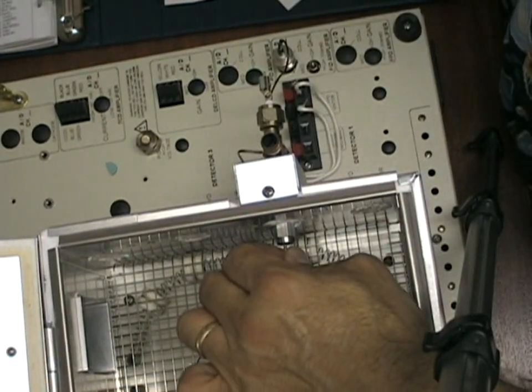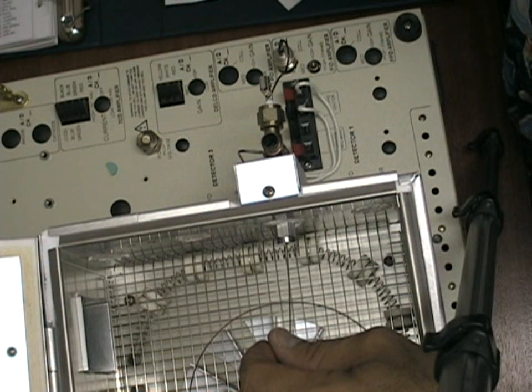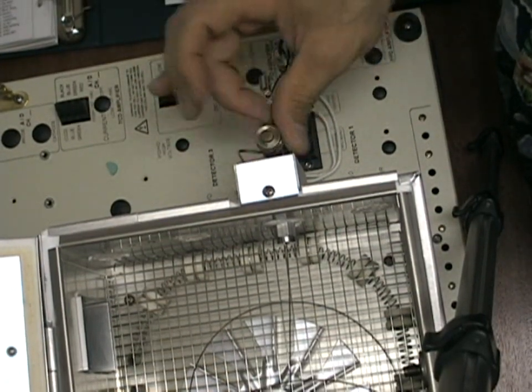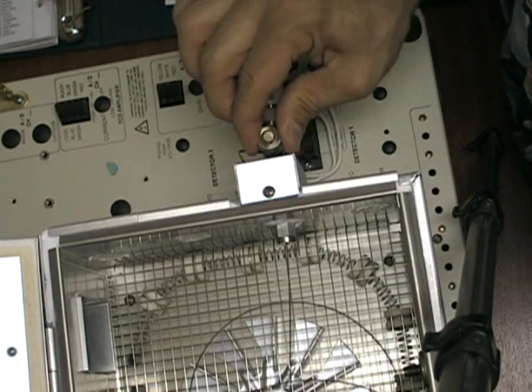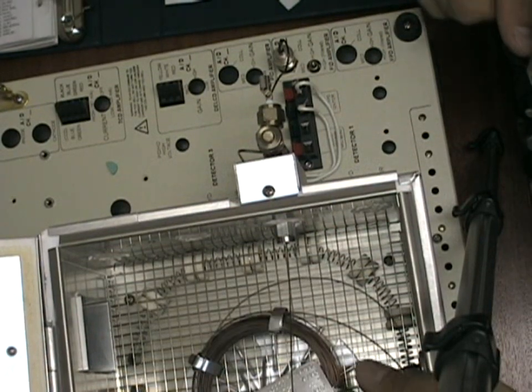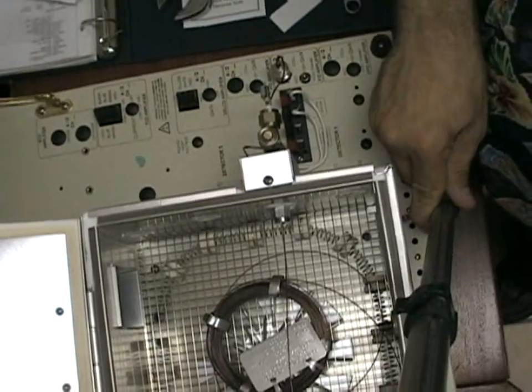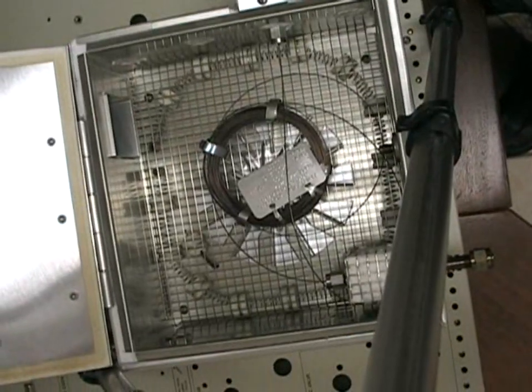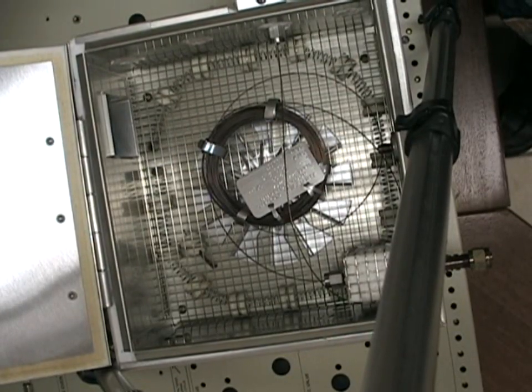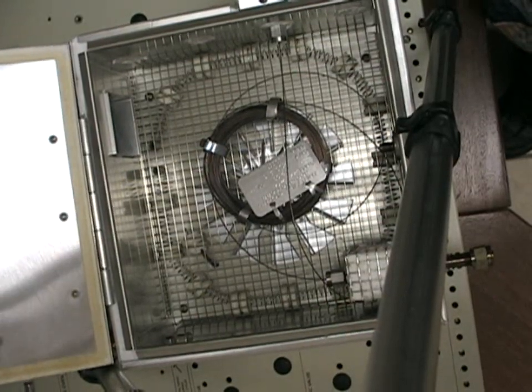Again, grab the end of the column and give a gentle tug to make sure it is secure. Replace the cap nut on the FID detector and just finger tighten that. Center the column in the oven and the GC is ready to begin operation. Just follow this procedure should you need to change columns or replace the existing column.